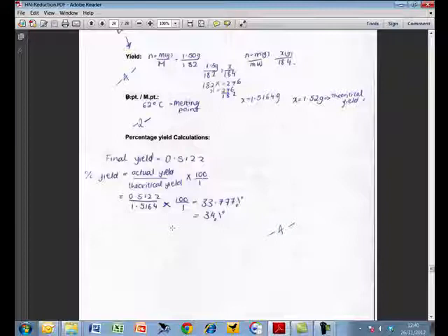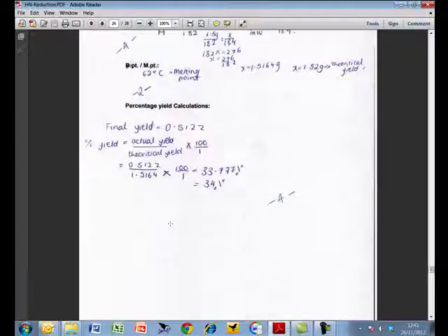So that is fine. If you remember the last day as well, I'd highlighted for you that on a sliding scale you would get marks depending on how much yield you had and how close your melting point was to the final value. So some things just to remember is really the whole procedure relies on you being careful in transferring material from one stage to another. So in terms of your filtration, in terms of recrystallization, filtering again, all those sorts of things, you're bound to lose some product. But obviously the more carefully you work and the better you can transfer things from one stage to another, then the more opportunity you have of a good yield at the very end.